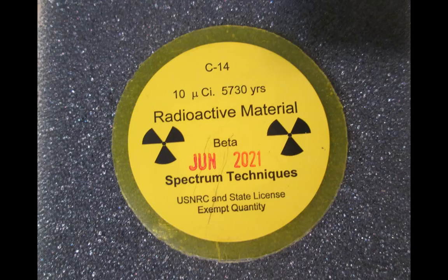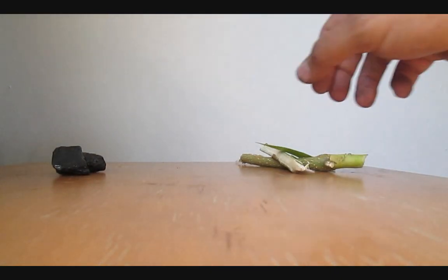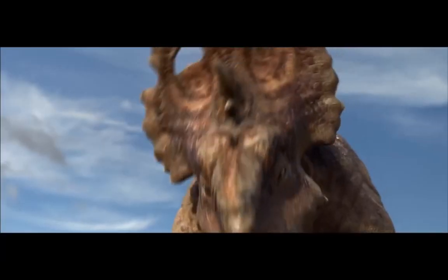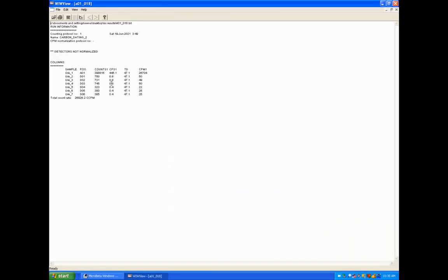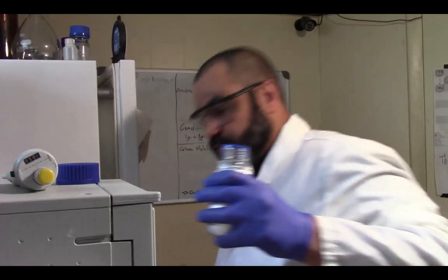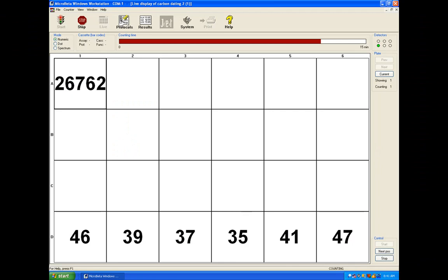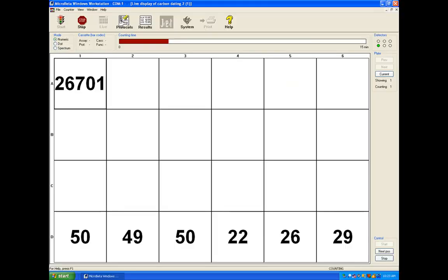Outside of standards and blanks, I've measured three representative samples: a very old one, a very new one, and this unknown. Just like petrol oil, coal is upwards of 300 million years old, and should measure like a blank, and it does. Depending on the amount of scintillation cocktail and other factors, I get a background between 20 and 40 counts per minute. Here are six replicates of the blank, and the number at the top left corner is my carbon-14 source, measured just under 500 Bq. After preparation, my very modern sample measured about 10 counts above background, or 0.16 Bq.